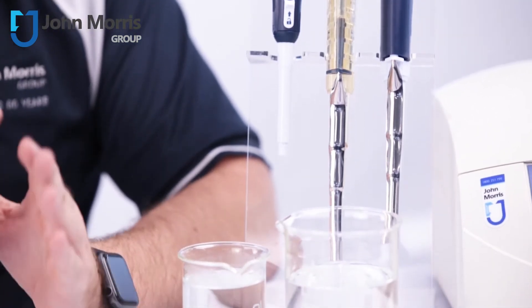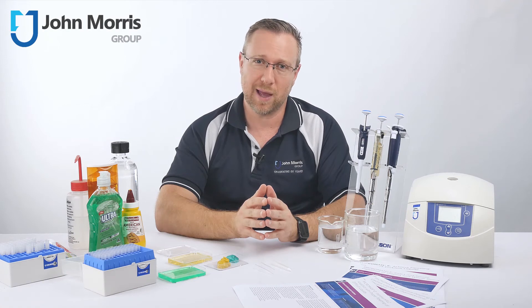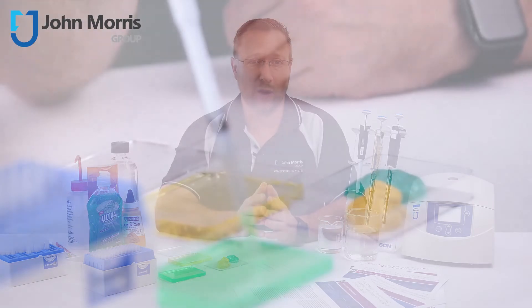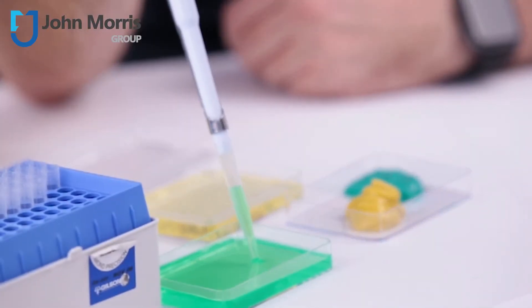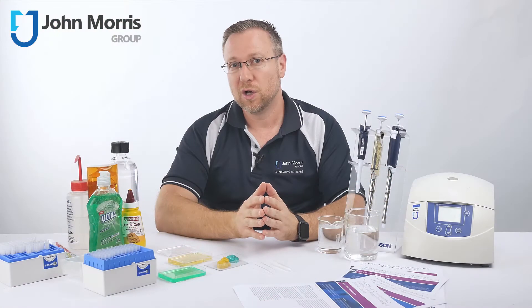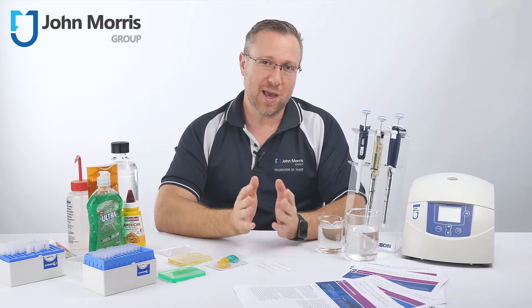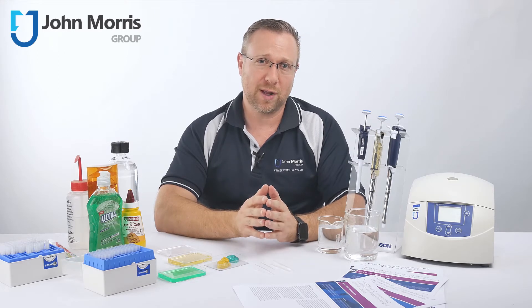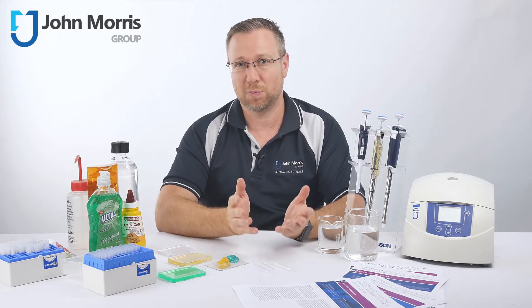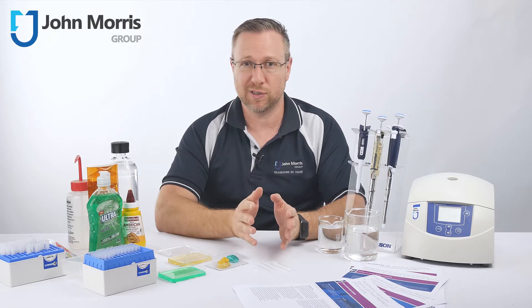Air displacement pipettes, such as the Gilson Pipetman, are highly accurate for most aqueous liquid pipetting applications. However, they won't work reliably if the liquid is viscous — like glycerol or Tween — volatile such as solvents, or if the temperature is hot or cold. Additionally, air displacement pipettes may not be correct where there's a risk of cross-contamination with biological samples such as blood, bacteria, or viruses, or carry-over of hazardous radioactive liquids.